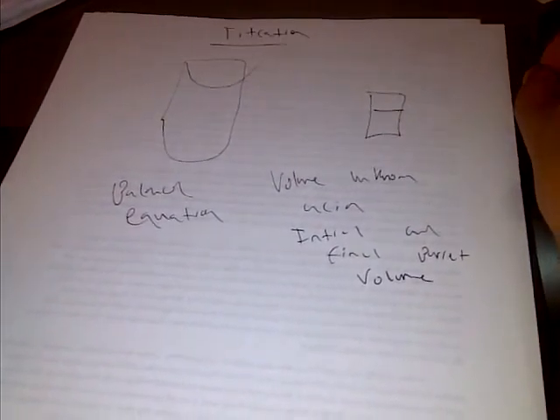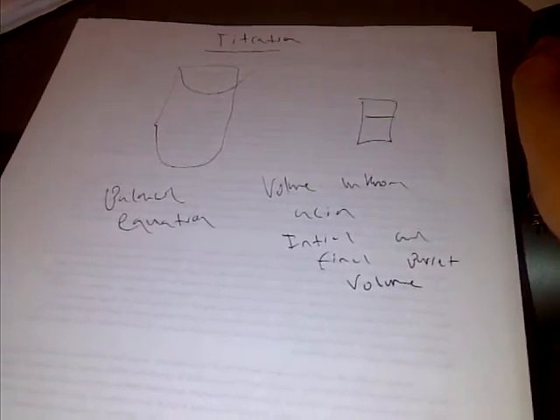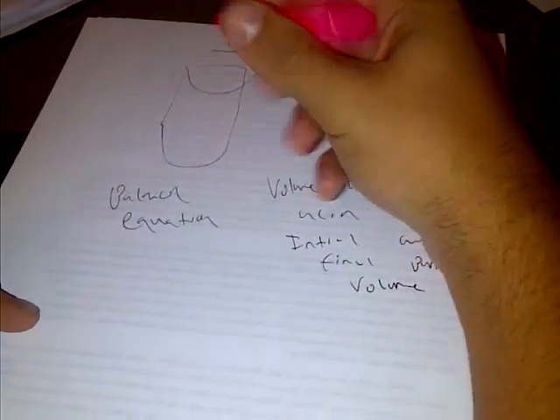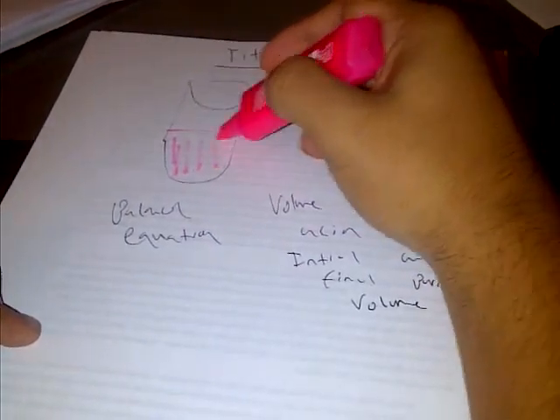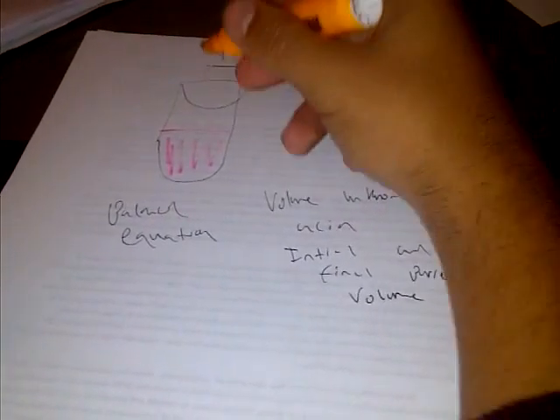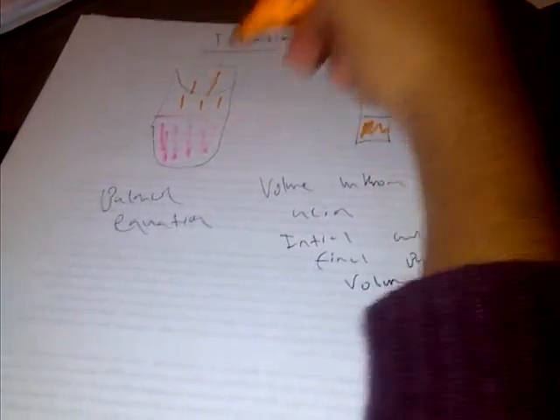And then we would add the pH indicator to the beaker containing the acid. So our pH indicator would be what changes color. So let's say we would put something right here. And then add base carefully. So we would start dropping what's in here into our beaker, drop by drop by drop.